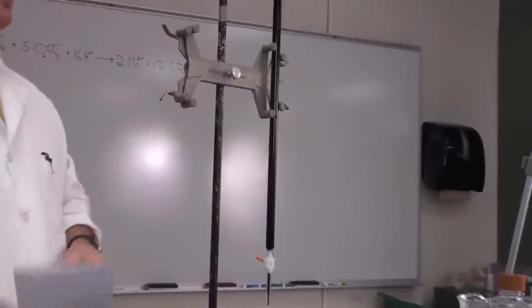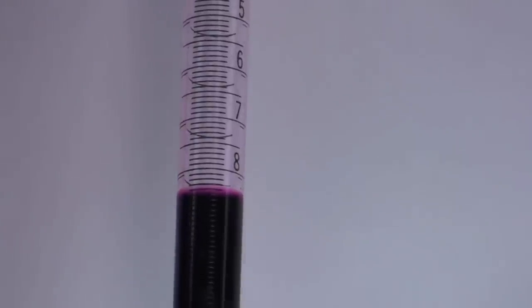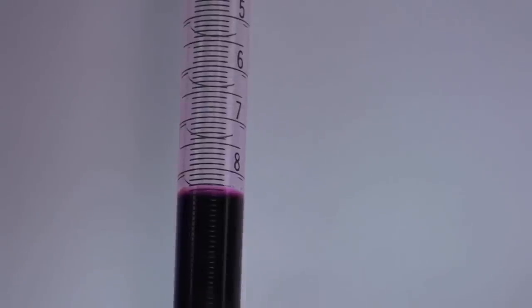So this is ready to go. Now we need to record our burette reading. As I told you before, it doesn't need to be zero—it can be somewhere near the top as long as we know what that is. Notice the burette has major lines every one milliliter, minor graduation lines every tenth of a milliliter. What that means is we ought to be able to read this to one one-hundredth of a milliliter where we're estimating that final hundredths place. As I read this, it looks to me to be about 8.31 milliliters. I'm estimating that hundredths place by noting the liquid level is just below the three-tenths line.